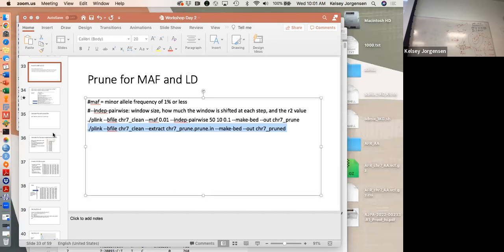You're in the right tab. Sometimes the problem we were running into yesterday is it doesn't like spaces in folder names, so I would try to rename these to single names and make it a single folder again.